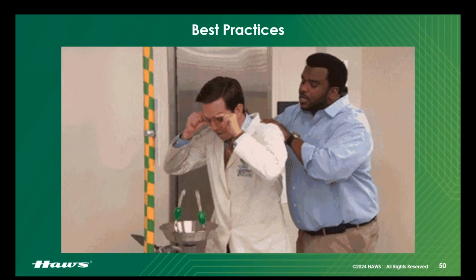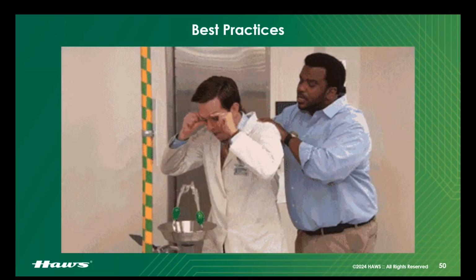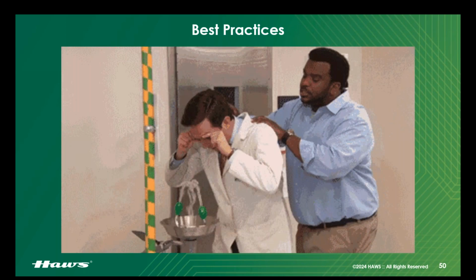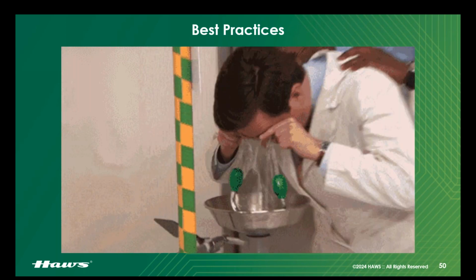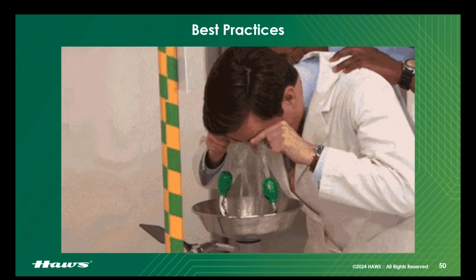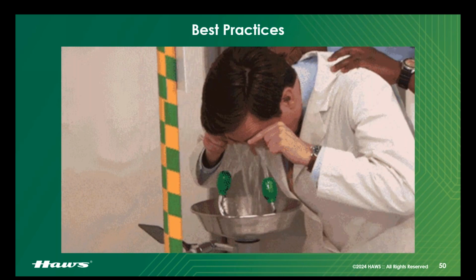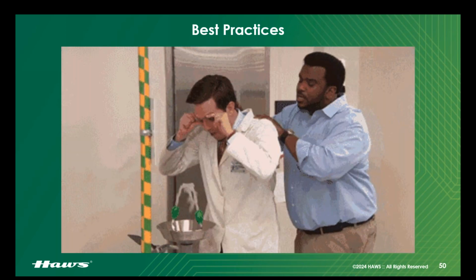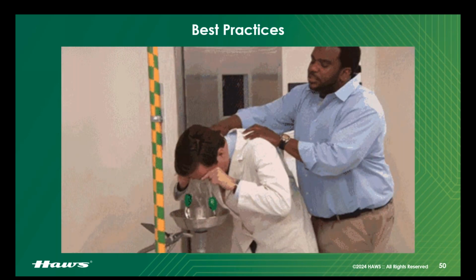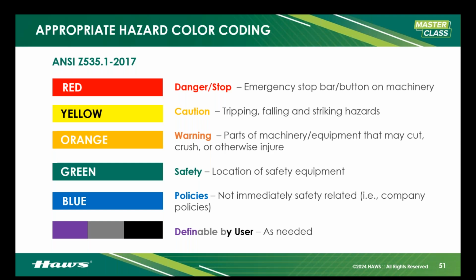Now, I include this. I just told you not to put your hands on somebody, but you probably recognize this clip. The reason I include it is this is technically great technique on the part of the Nard dog there. He's got his fingers in his eyes. He's really stretching them out and throwing his face in there, and I really like it. But yeah, make sure you're really digging in and rotate your eyes to ensure you get fully cleaned out in there.